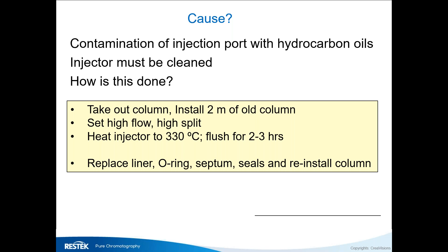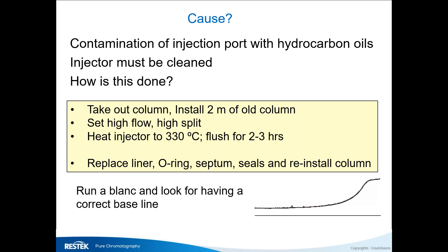To clean the inlet: take out the column, install two meters of an old column at high flow and high split, do not connect to the detector — plug it off during maintenance — then heat up the injector and let it flush for a couple of hours. Replace the parts and run a blank. The blank should look clean; if there's still garbage on the baseline, repeat the procedure a few more times.